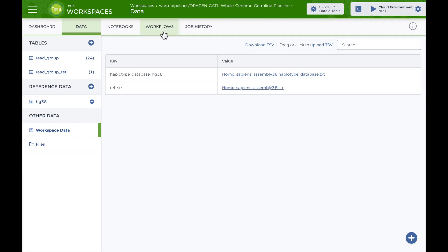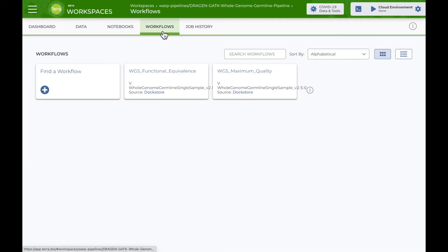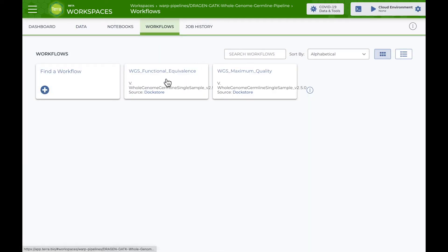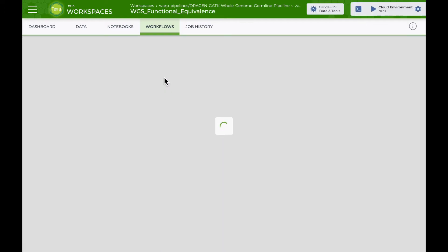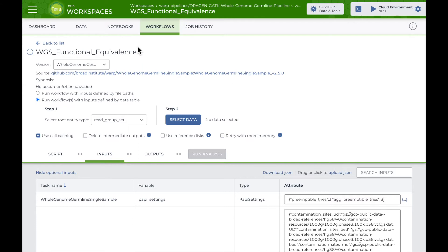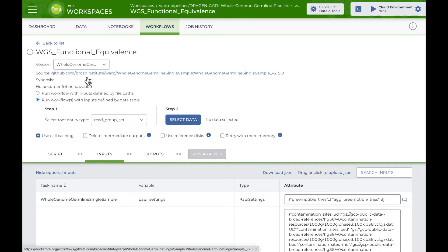To view the workflows, go to the workflows page and select the functional equivalence workflow, which takes you to the workflow setup page. This is where you can view the workflow name, the version, and the source. If I select the source link, I'm taken to Dockstore, where the workflow is stored.